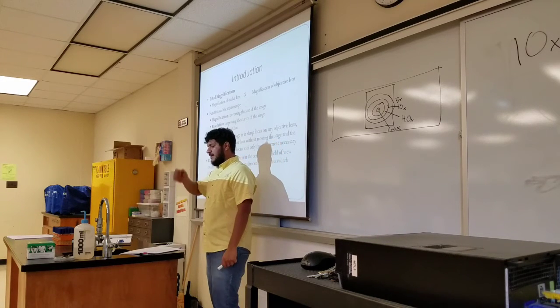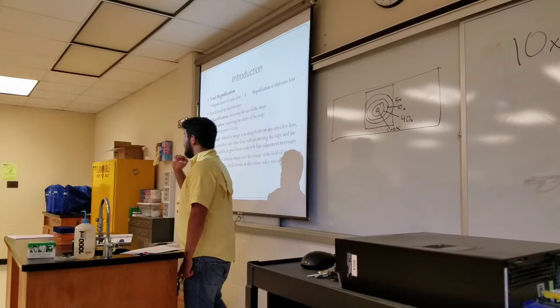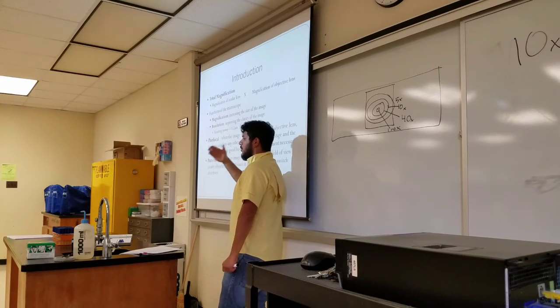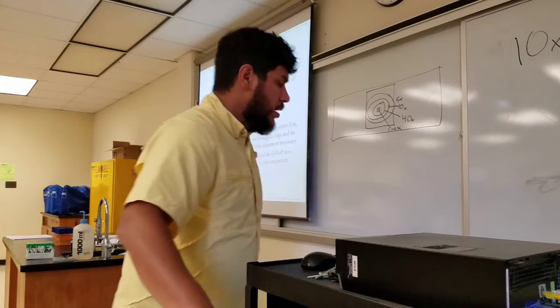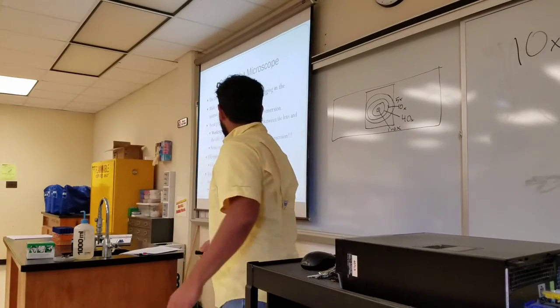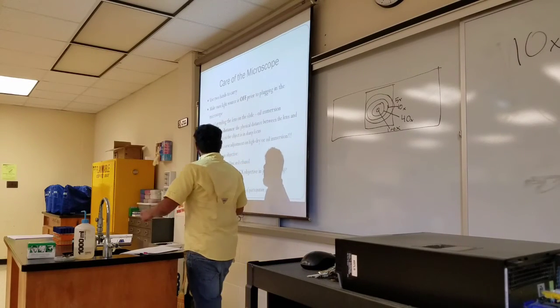The lenses remain focused when we rotate the revolver, without the necessity of moving them too much. It will get slightly out of focus, but we use the fine adjustment knob to correct that. I will demonstrate later on in the class. All right, let's continue with how to take care of a microscope.